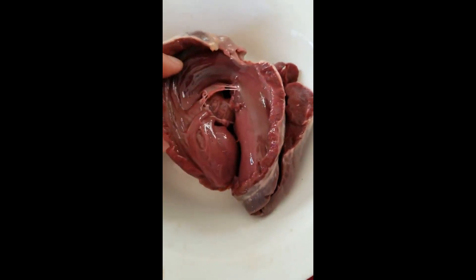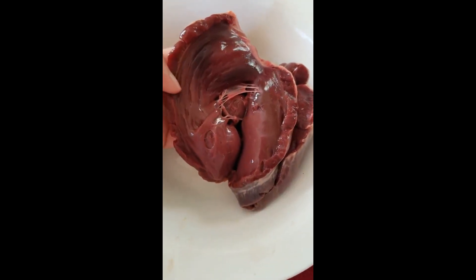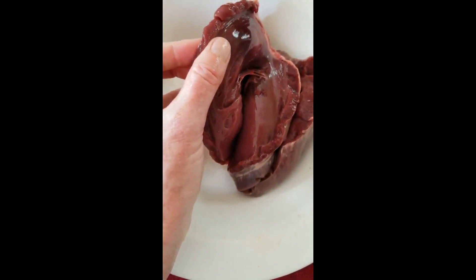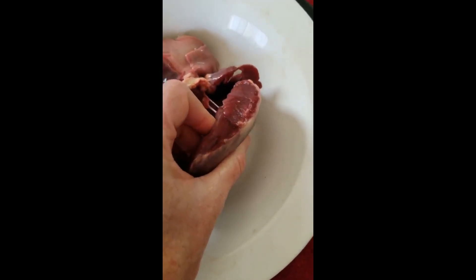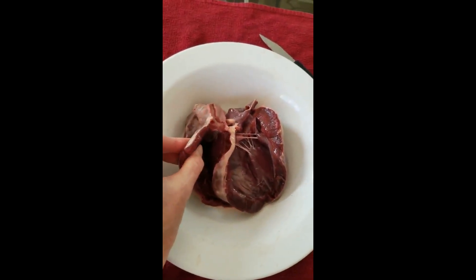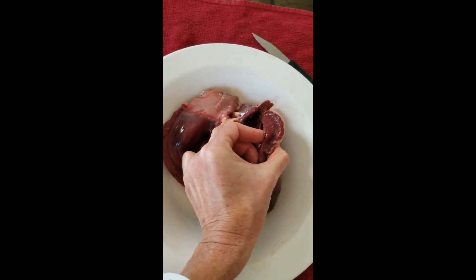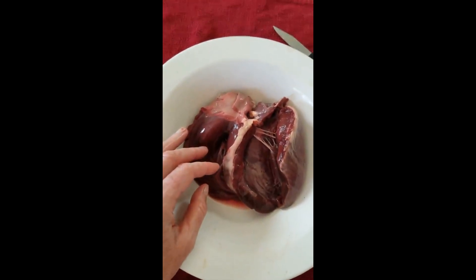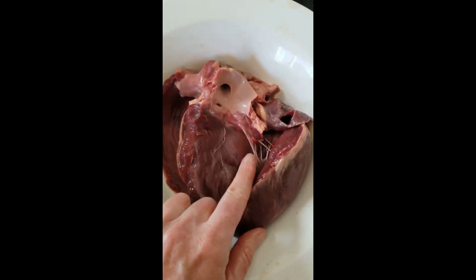The tricuspid valve separates the right atrium from the right ventricle — my thumb has gone up into the right atrium right now. The right ventricle only has to pump blood to each lung, so if we compare the wall of the ventricle on the right side it's fairly thin compared to the thickness of the wall on the left side. That's because of differences in distance: the right ventricle sends blood only to the lungs right beside the heart, while the left ventricle has to pump hard enough to get blood throughout the entire body — up to the brain, down to the toes and fingertips.